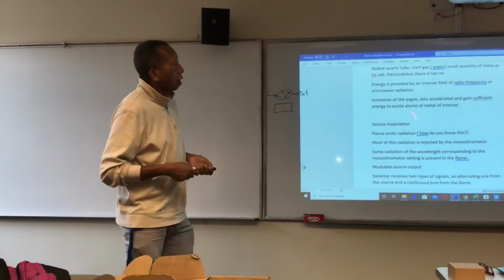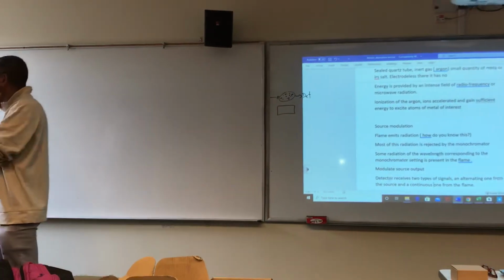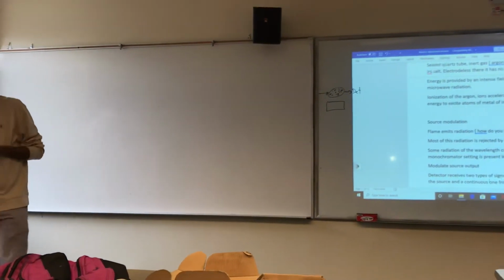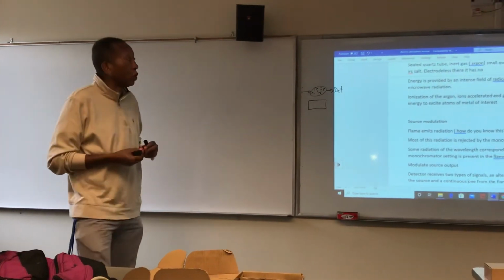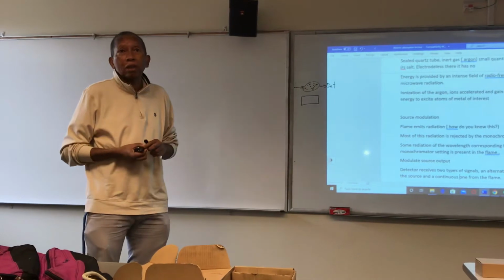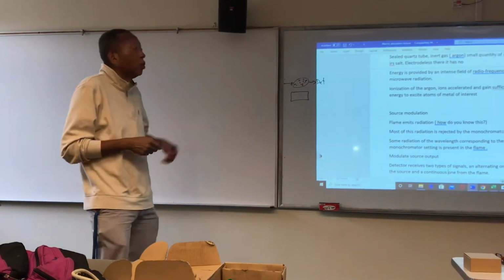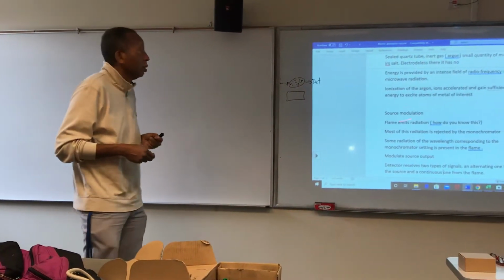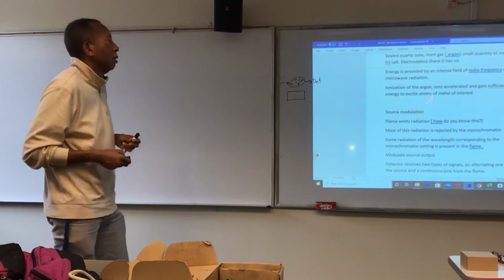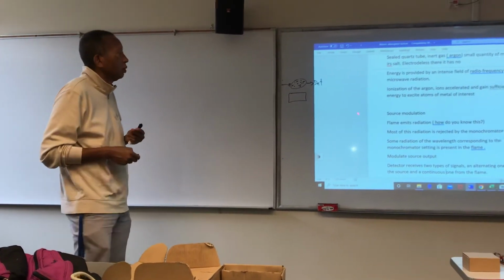If you've played an instrument, then you have an idea of what modulation is. Someone says, well, I want to change the key that I'm singing this song in. That means they want to change the frequency, to go to a higher key or a lower one. So that's an example of modulation. Someone says, I cannot sing it in A, let's go down to C. So that's source modulation.